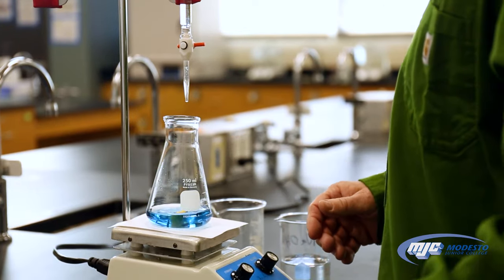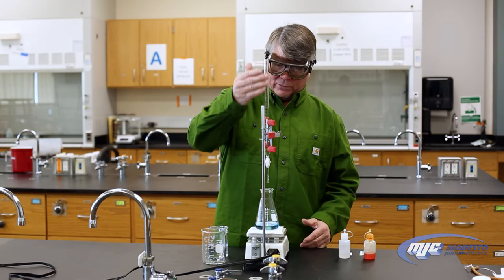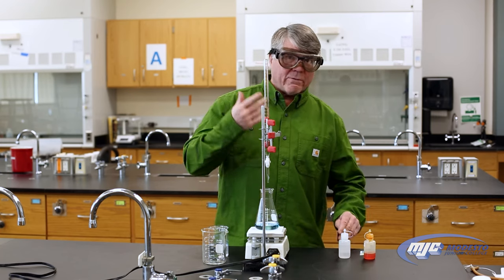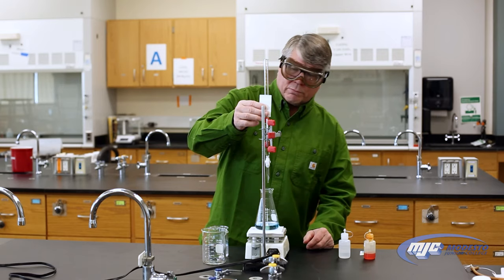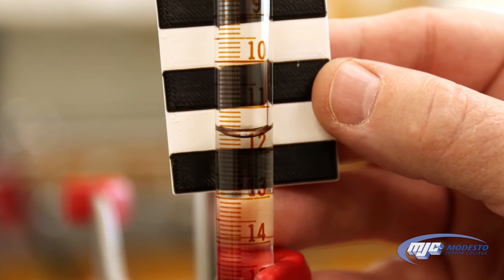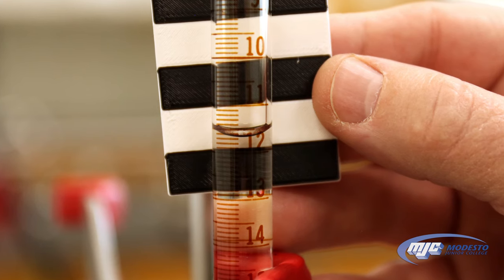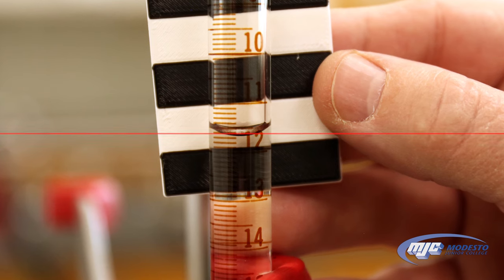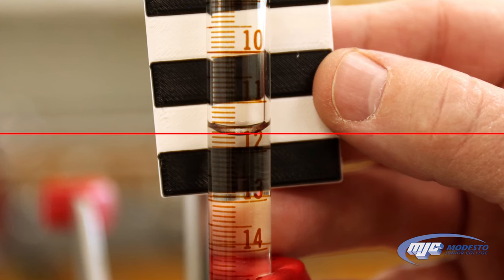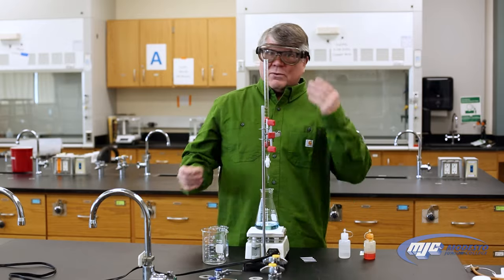So it's pretty close to the 7.5 color. Now that we've finished the titration, it's really important to read the final volume. Just like we read the initial volume, we're going to hold the zebra card up to the burette and read two places past the decimal. That looks like it's about 11.61 milliliters. Write that in your data table and you're finished that run.